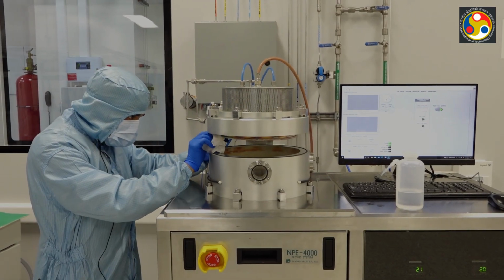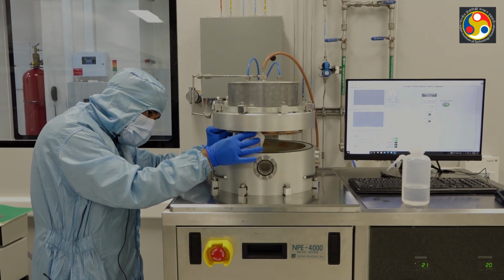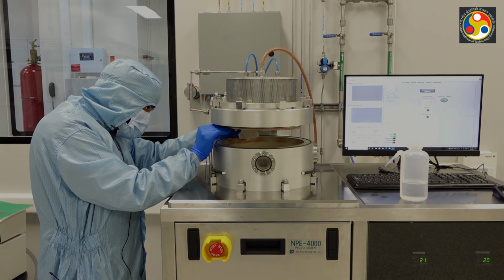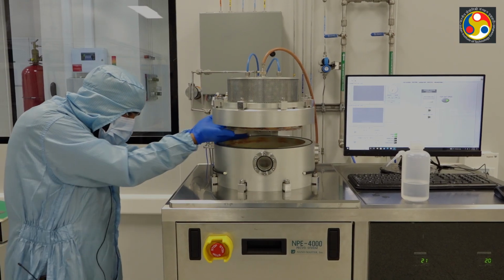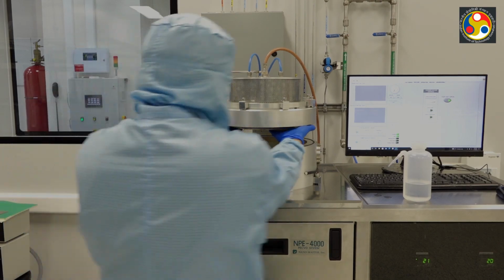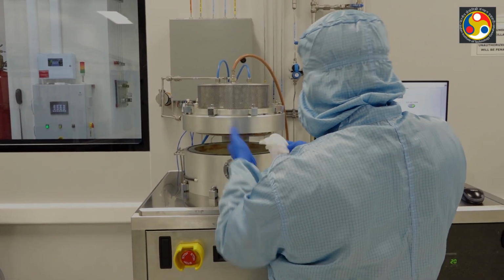You have to be very careful with these gas distribution rings. These are very delicate. Just hold them with one hand and very gently wipe with the lint free cloth. Then the shower head, very gently without disturbing the rings.